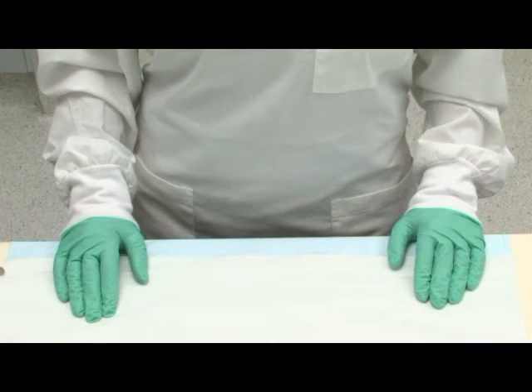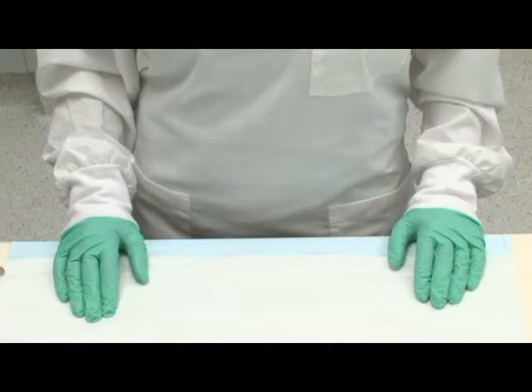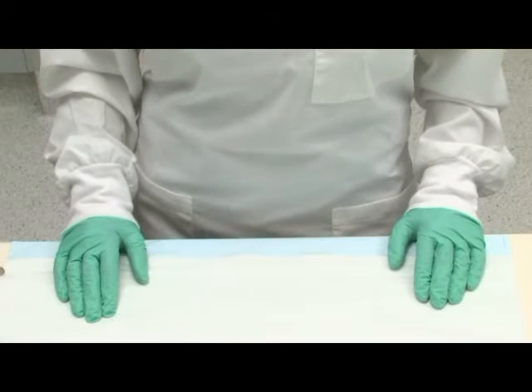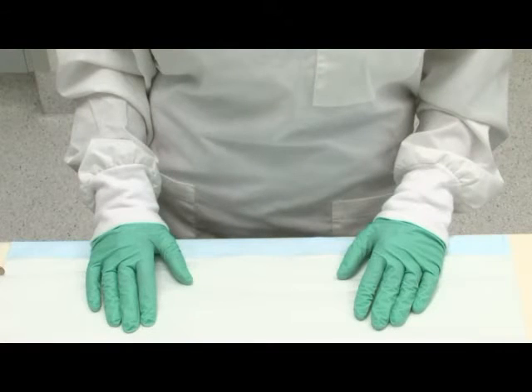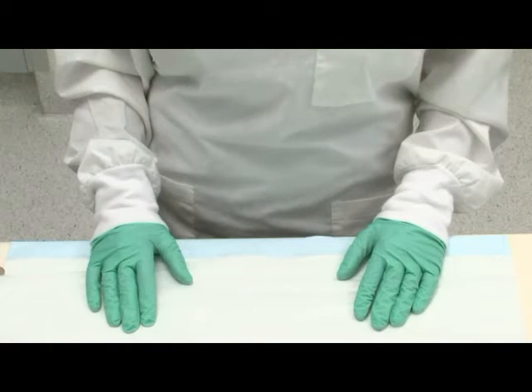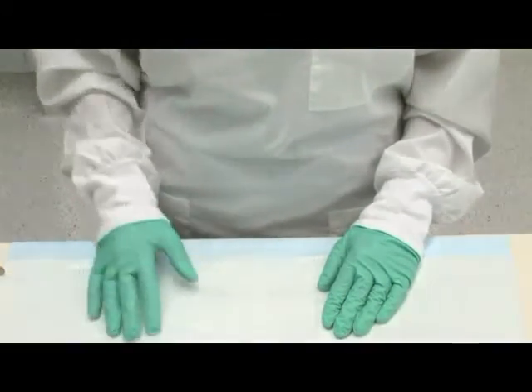Please ensure you are using all necessary personal protective equipment before starting this experiment. In this video, we will be inoculating a prepared nutrient agar plate with liquid microbial culture using aseptic techniques. Note that gloves, safety goggles, and a lab coat must be worn at all times.